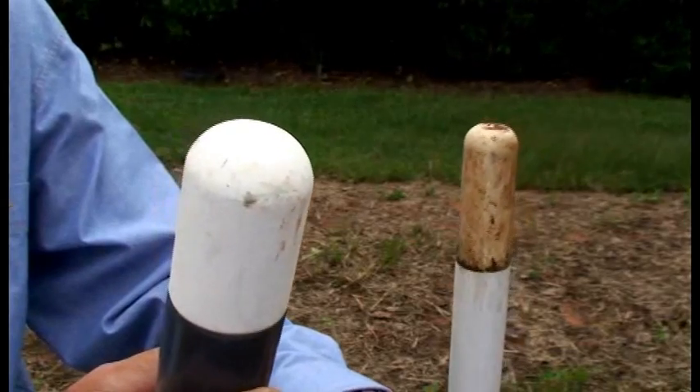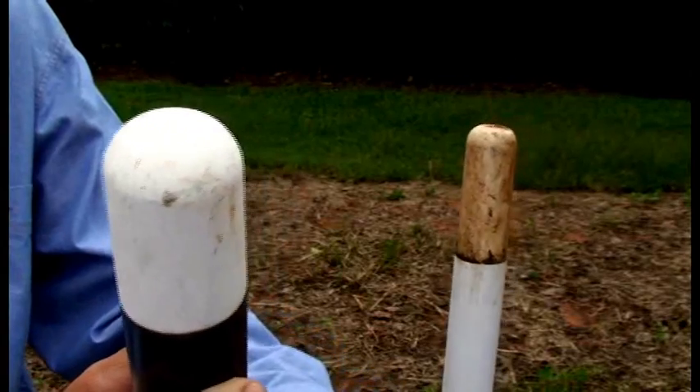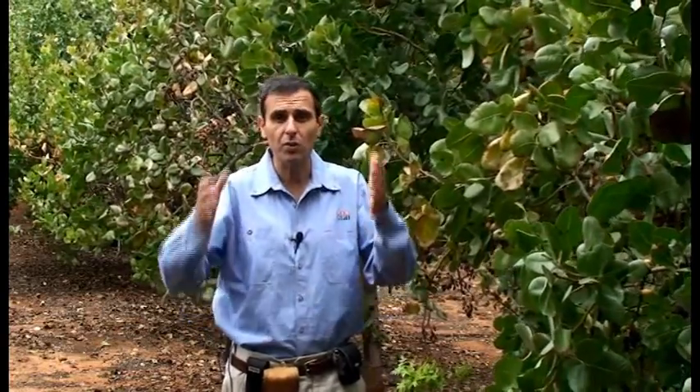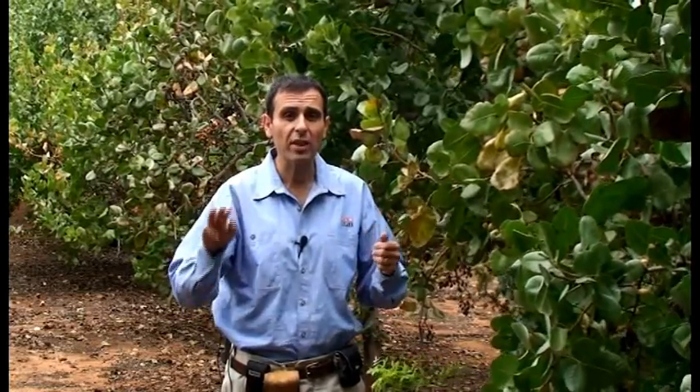There are slightly different specifications on the ceramic tip's characteristics between manufacturers and models, so you need to make sure you get one that suits your conditions. The limitation of soil solution extraction devices is that they require an irrigation or major rainfall event for a sufficient volume of sample to be taken. The results can also be variable within a block due to the complex nature of soils and how water and nutrients move and interact in the soil. It's advisable to install at least three sites in a block until you can gain confidence that sampling sites are generally providing similar results.